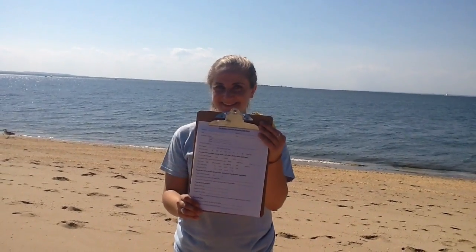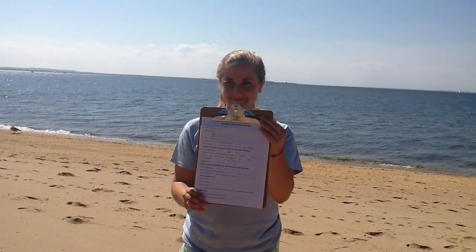Before taking any samples, make sure you have all of the materials needed for collection. You will need a volunteer sampling data sheet, a pen or pencil, gloves, three location markers, a measuring tape, a GPS or smartphone with GPS capabilities, a quadrat, six collection jars that have been cleaned and labeled according to COA protocols, a metal spoon, and a ruler or tape measure.